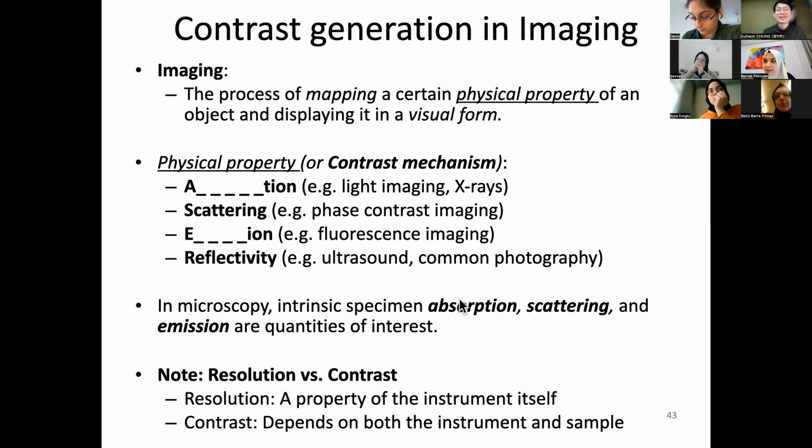I think I understand what you say. In histopathology or histology class, usually you are using hematoxylin and eosin. Yes, we also use that, but there are some receptors, so we also use immunofluorescent staining.